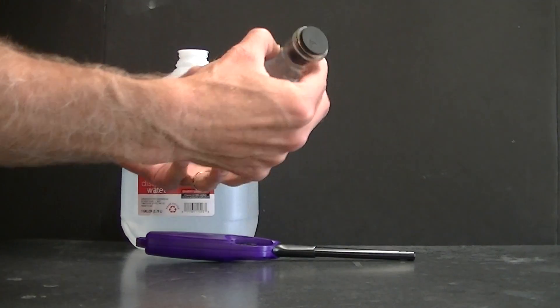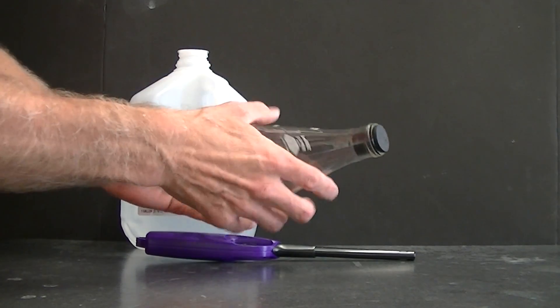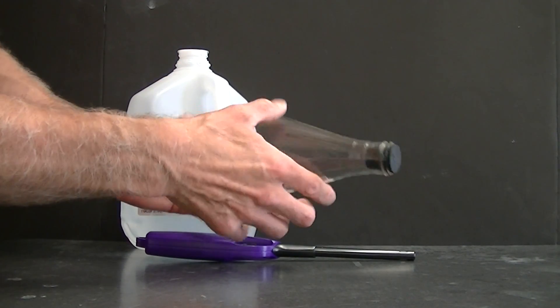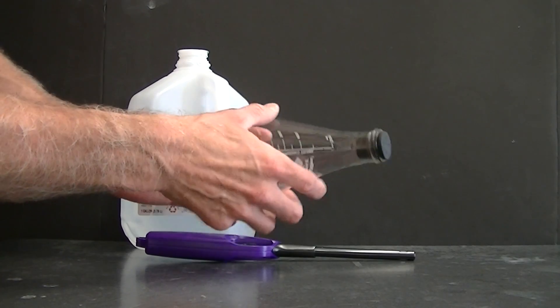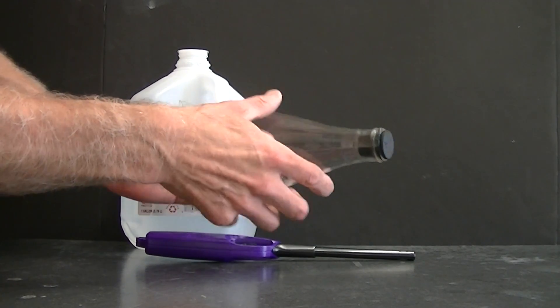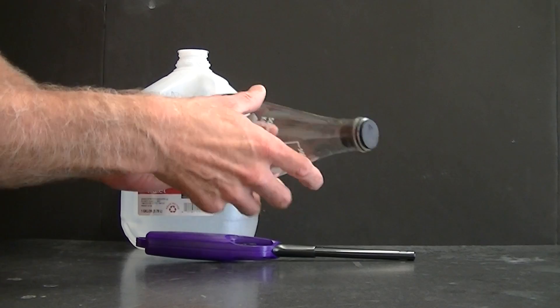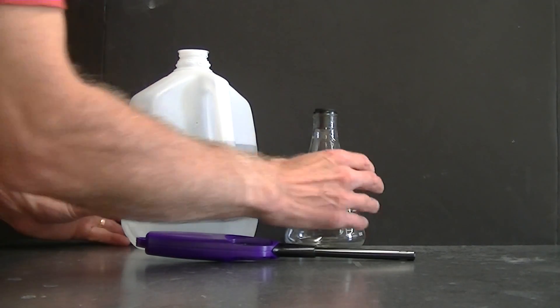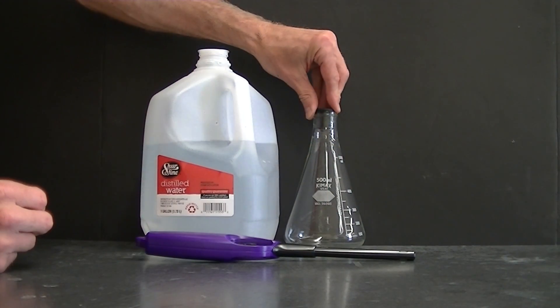Right before doing the experiment and without the audience seeing it, I'm going to coat the inside of the flask with the hexane, just by rolling the flask.